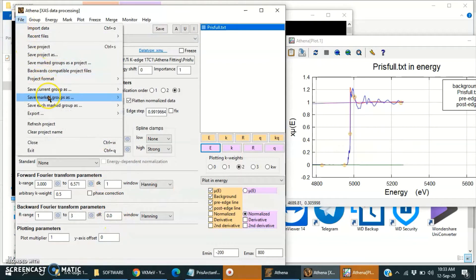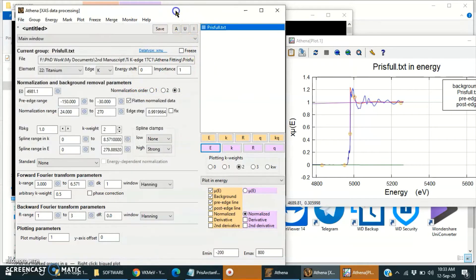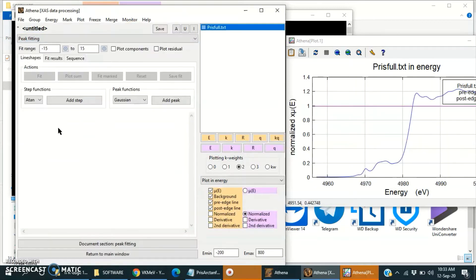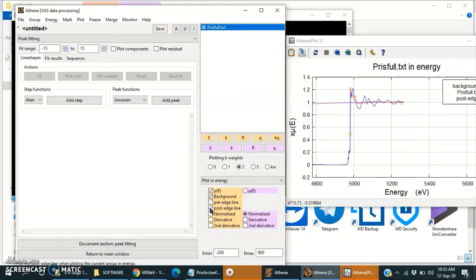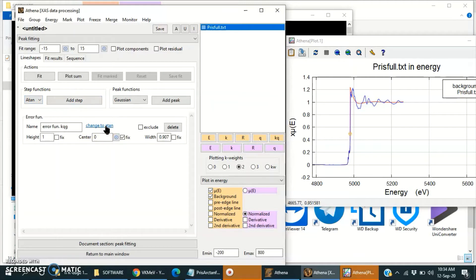We can save it from here — save marked group as mu(E). Now switch to the fitting software and remove the pre-edge and post-edge lines. Now we will add an arc tangent function. We can change this function to an error function also, but I am going to use the arc tangent function.